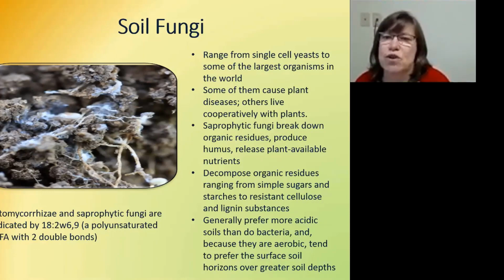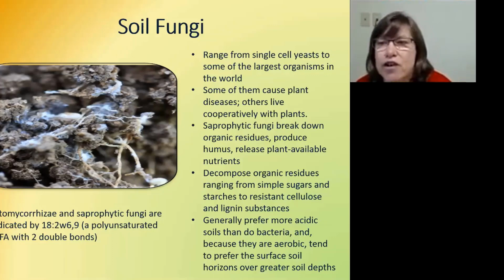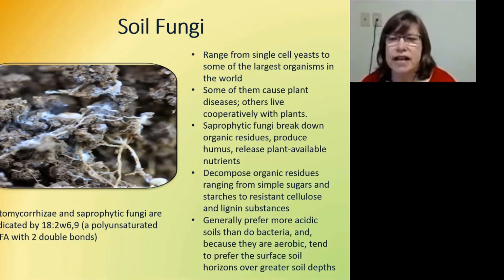So the role of soil fungi, first off, it's a broad category. You have everything from single yeast cells to some of the largest organisms in the world. And I know in Michigan you have some of these fungi that take up acres or maybe square miles of territory.